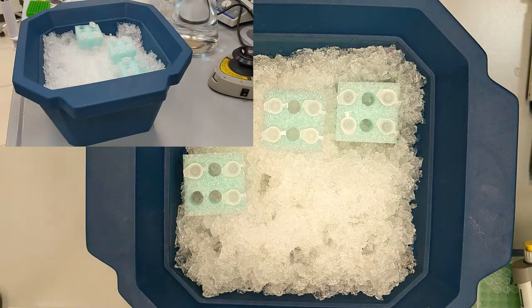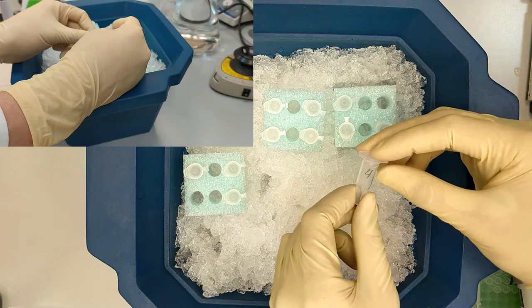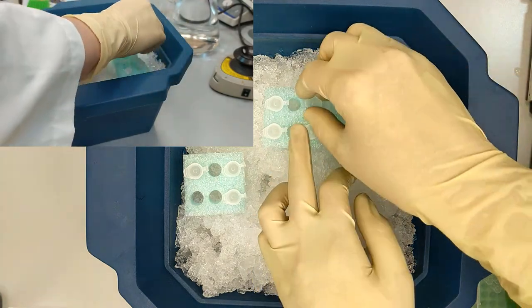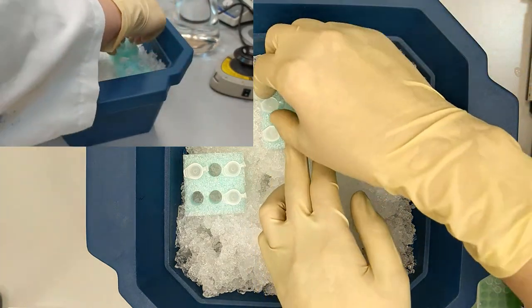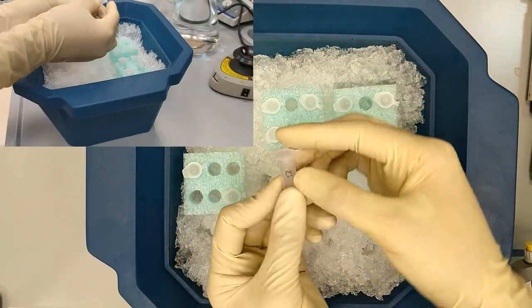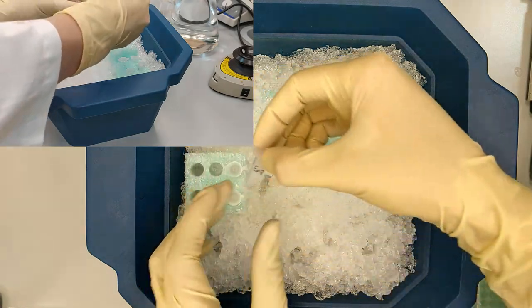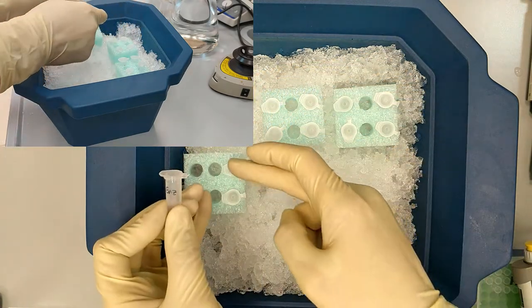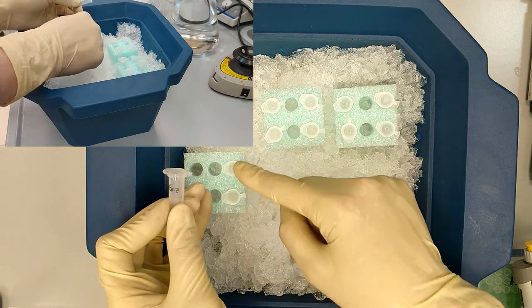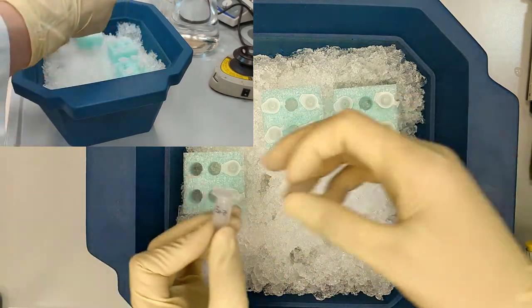Okay, so in this lab, we will be giving you the samples. So, for example, suspect 4. And also the crime scene. And you will be adding 10 microliters of enzymes into each of these tubes. So we will have two sets of crime scene, first, second, third, and fourth suspect.